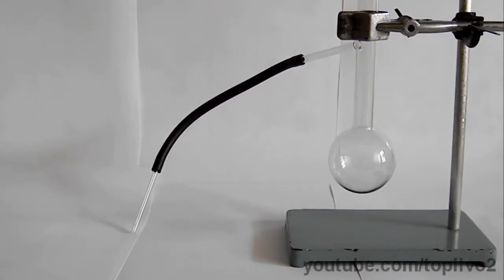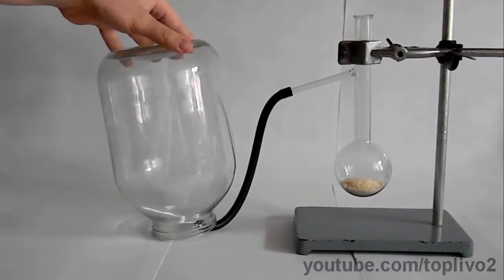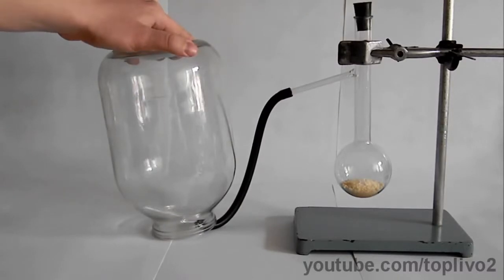We will get ammonia gas from a Wurtz flask. We need a mixture of sodium hydroxide and ammonium nitrate. Now pour the reagents into the flask. Since ammonia is lighter than air, it is best to collect it from the bottom of the vessel. To start the reaction, we will add some water to the mixture. The reaction has started, and now ammonia is entering the glass jar.